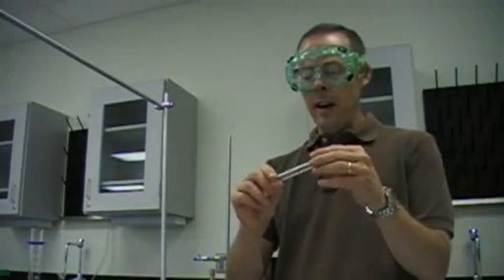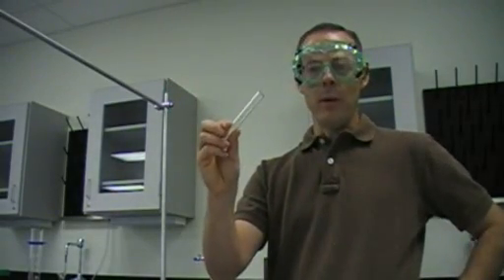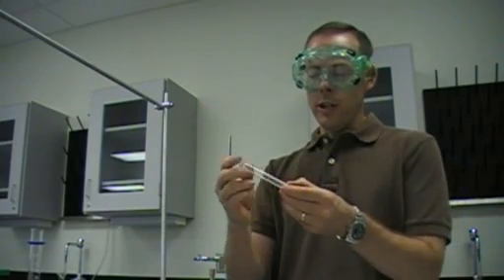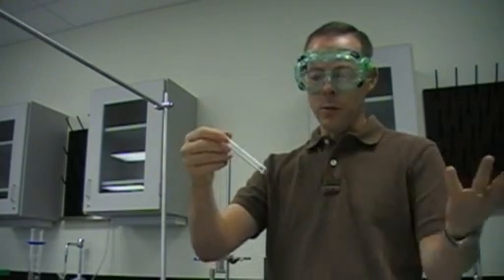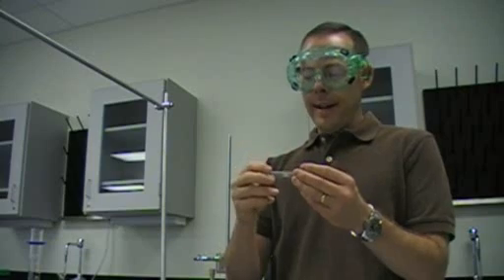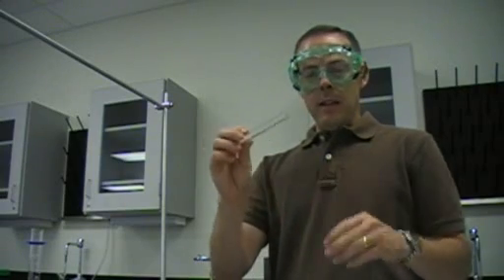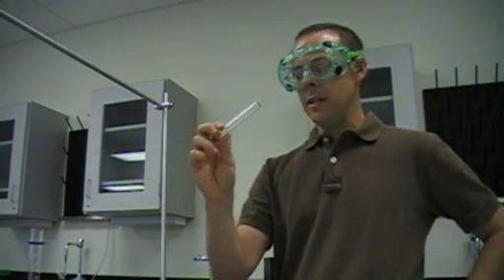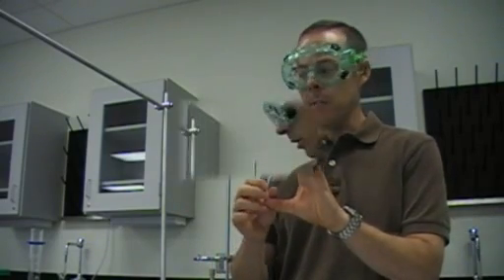The other thing that you'll see liquids in is a test tube. And obviously, this is a terrible way to get an approximate amount because there's not a marking on this whatsoever. So unless you can eyeball and say this is a milliliter, this is a terrible way to get an approximation. And certainly not a way to get a specific reading. So test tubes aren't really good for measuring whatsoever, just for conducting small experiments.